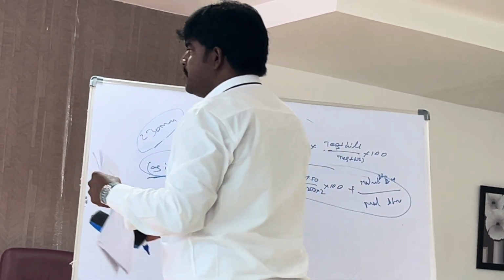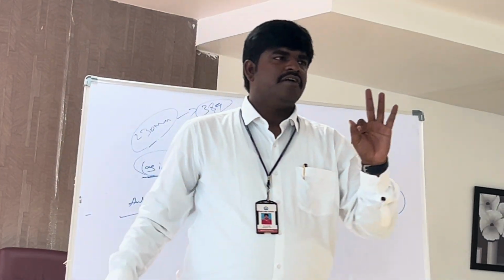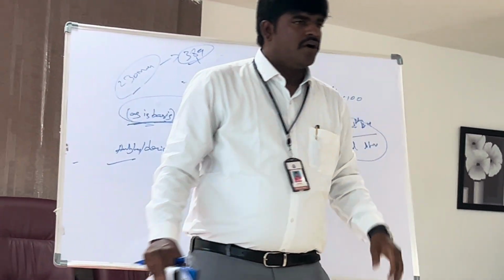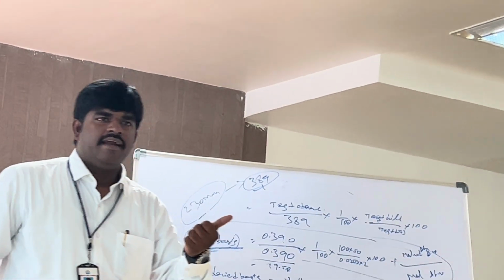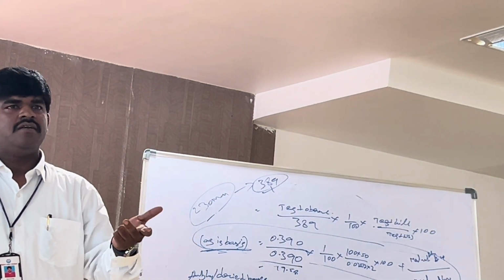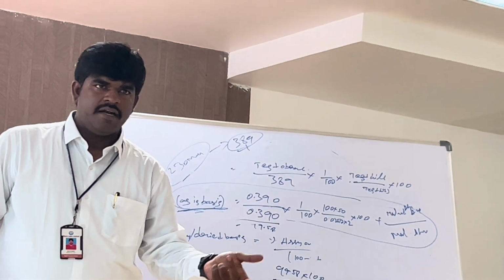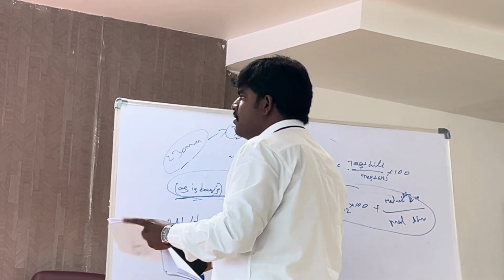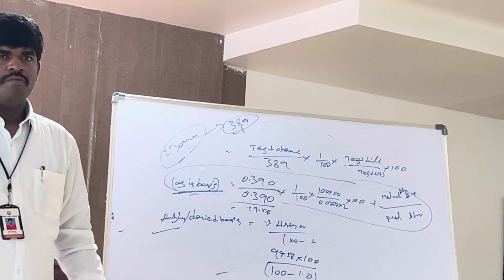And next, HPLC. In HPLC, there are 3 types of calculation we most often use. One is if you want to calculate the API-SA value, second if you want to calculate the tablet or capsule, and third, injection or a suspension. So first I will explain the API, followed by tablet, and third, suspension or injection. The API is also similar. First we prepare the standard, followed by we prepare the sample.